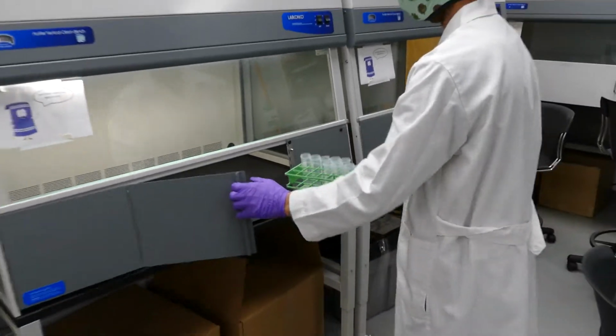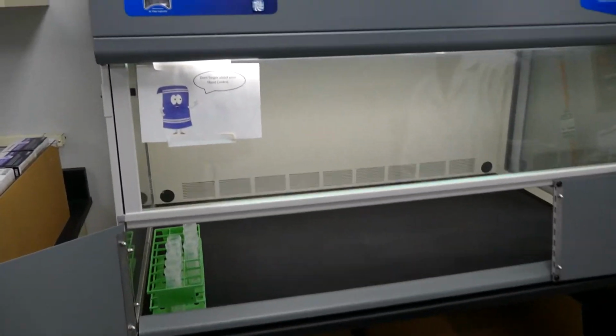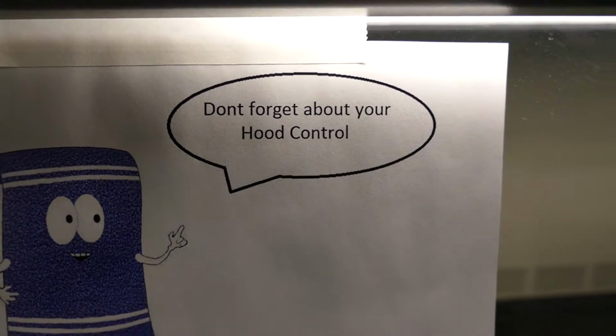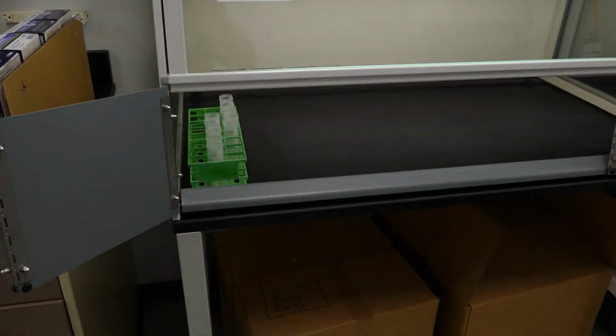Along with the samples, a hood control is needed. Place a clean 50 milliliter centrifuge tube in a clean tube rack labeled with the case number and sample range that makes up the control. Label the cap too and place on the tray with the rest of the samples.